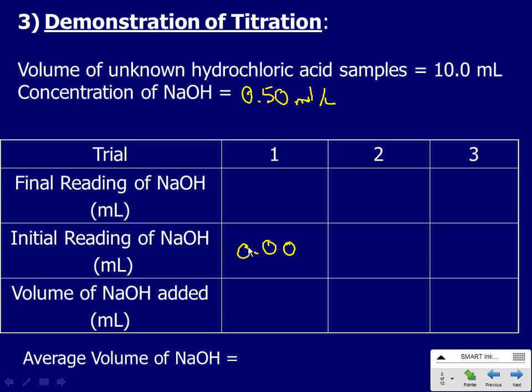I know that these 2 concentrations are about the same, which means I'm going to get a neutralization of about 10 milliliters, all right? At first, the color isn't going to do anything, but you guys did a little activity at the beginning where you kept adding it. What you did there where you added and stirred, remember how the color came and then it would disappear? You did a titration, but you did a really inaccurate titration. It wasn't using the proper equipment, but it was just to see what happens to the pH as you titrate.